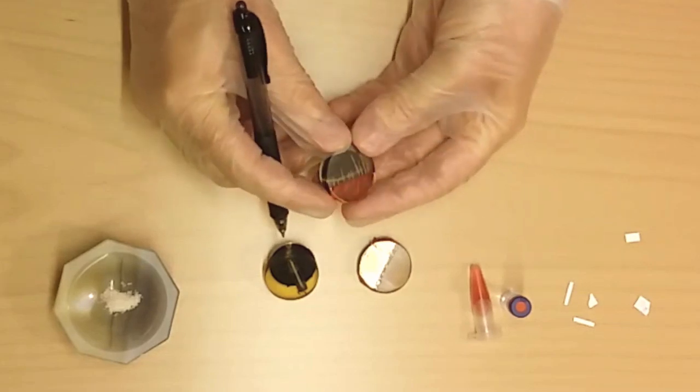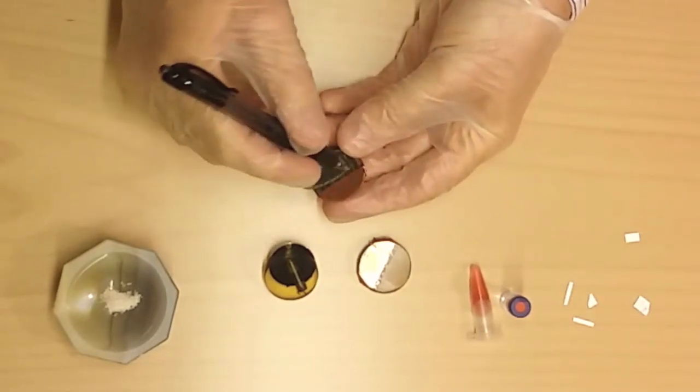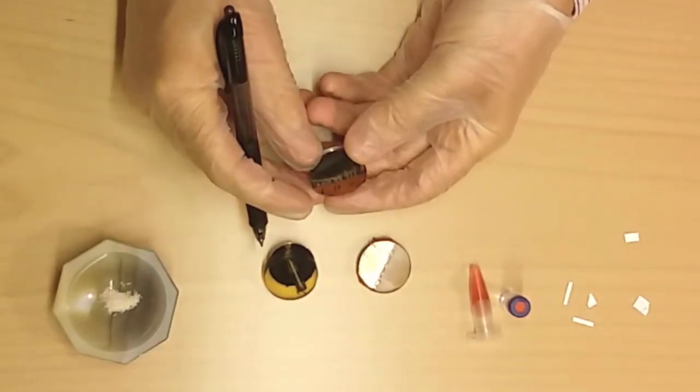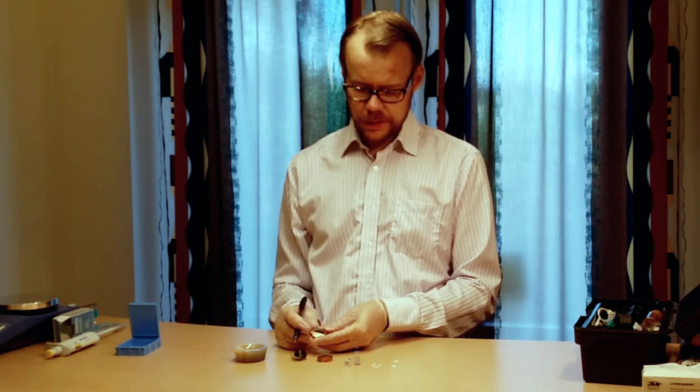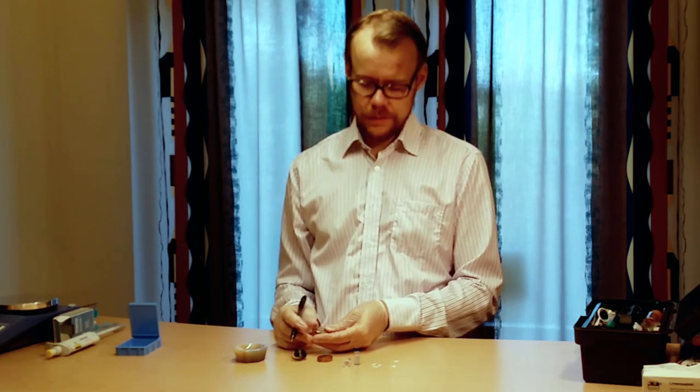This one, for example, is the same kind of technique but instead here the sample is in silicone. We wanted to see the composition of contamination in the silicone.